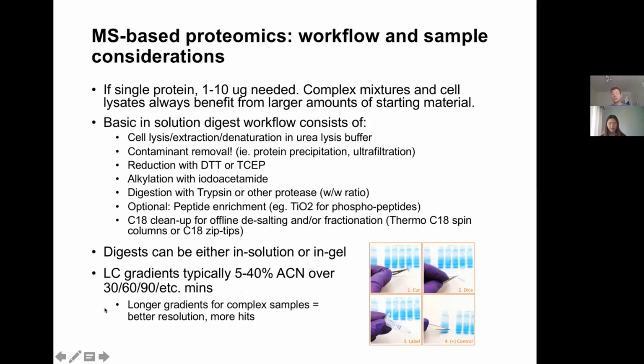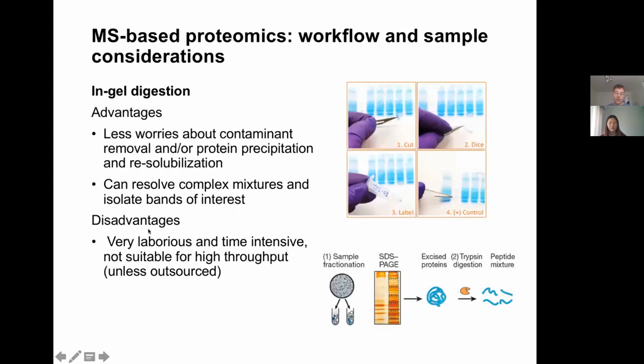The longer the gradients, the better the resolution. But of course, there's always the issue of machine time. So that's the in-solution digest. And on the other hand, we have what's known as the in-gel digestion, which can be very handy. A few advantages is that you don't have to worry about removing contaminants, such as detergents. And there's no worries about protein precipitation and resolubilizing after.